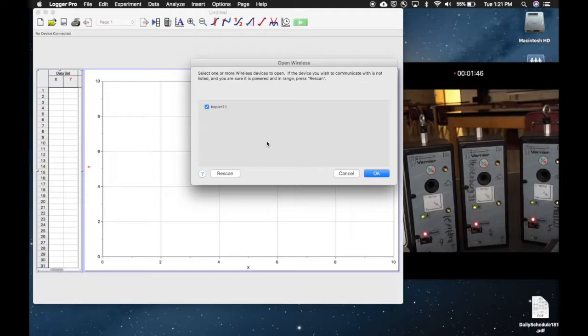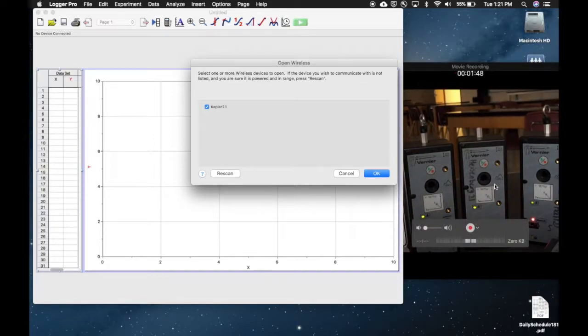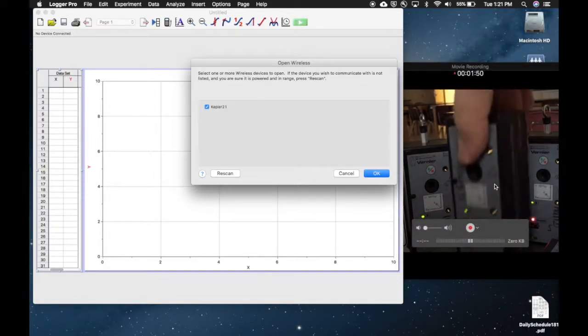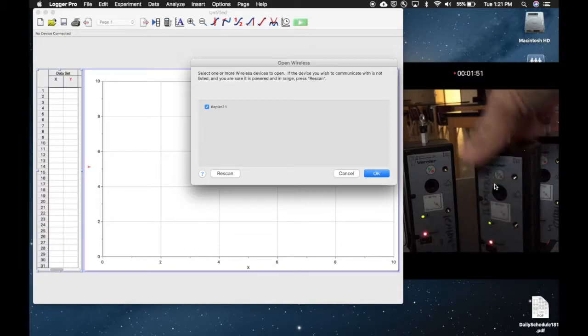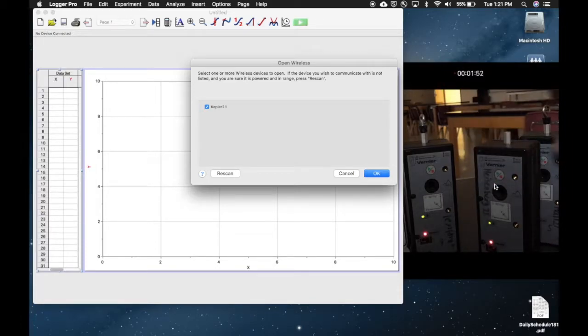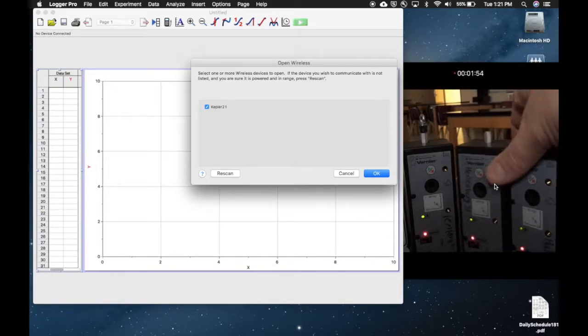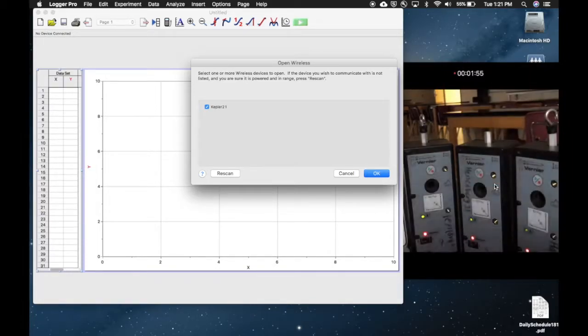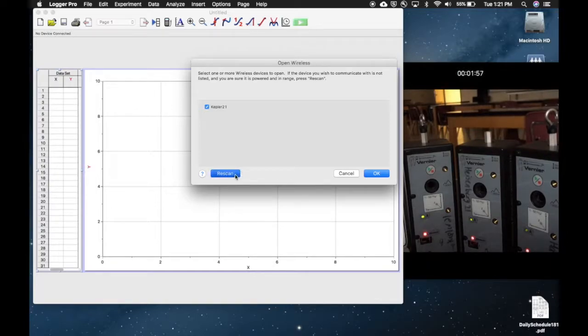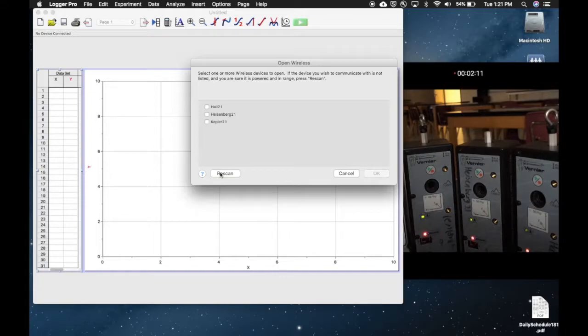It said we got Kepler but it should have brought up the other two as well. What I'm going to do is say Kepler wasn't yours - that's one at the lab table next to you. Let's rescan and see if we can get more. That's better, now it brought up all three.